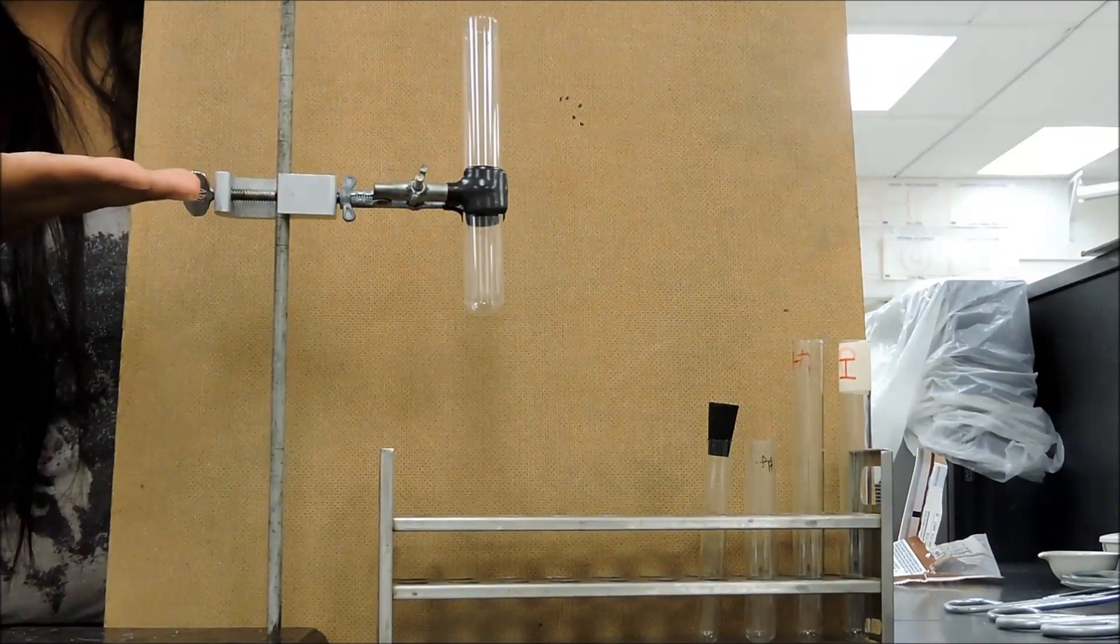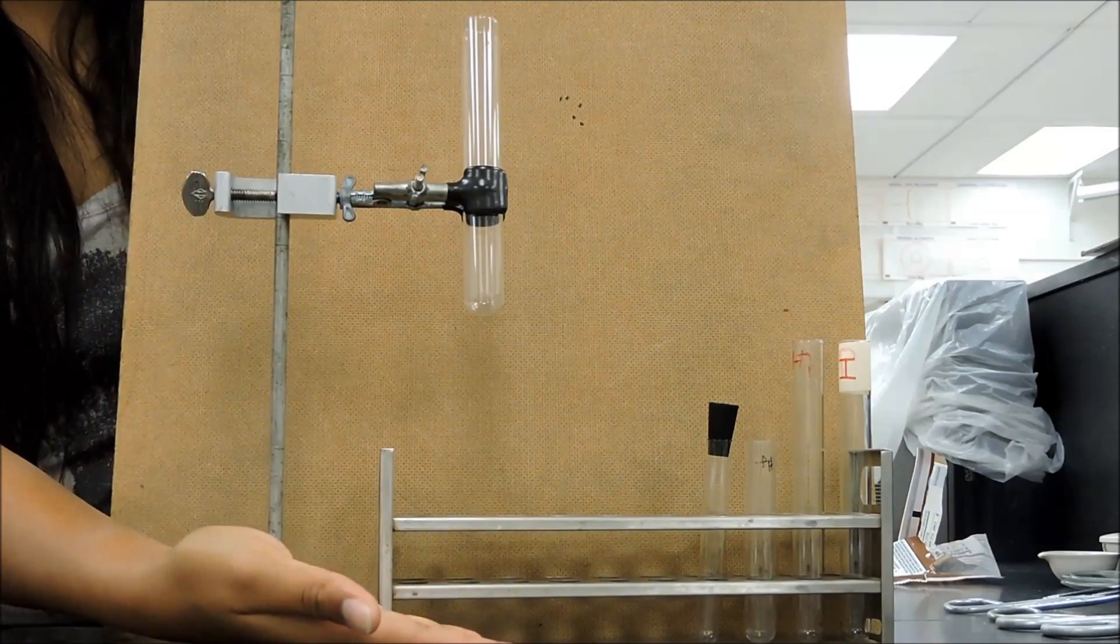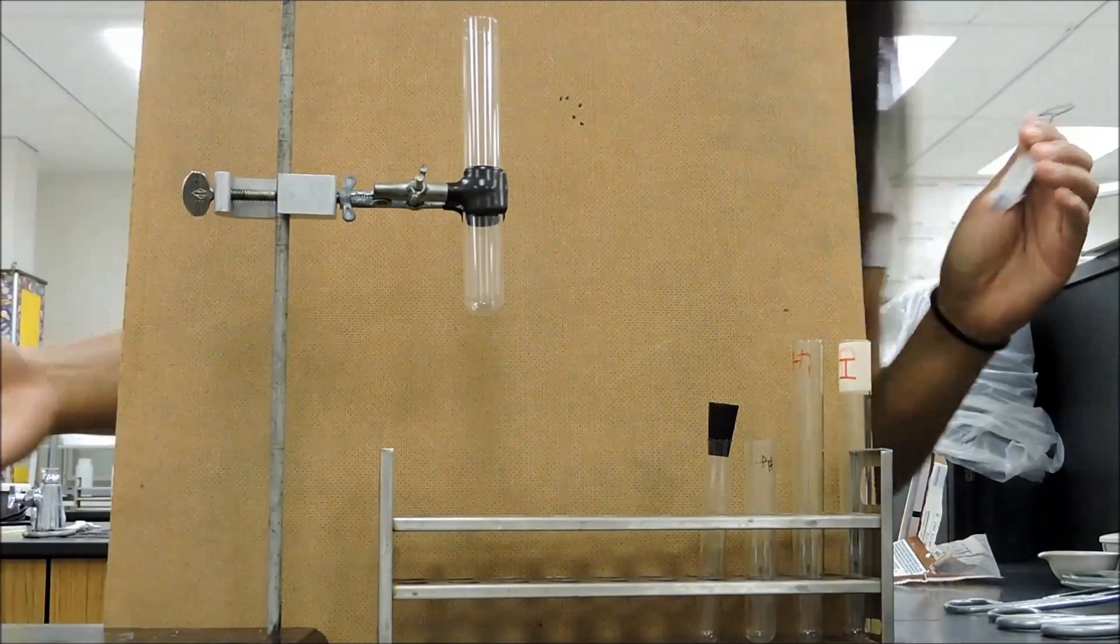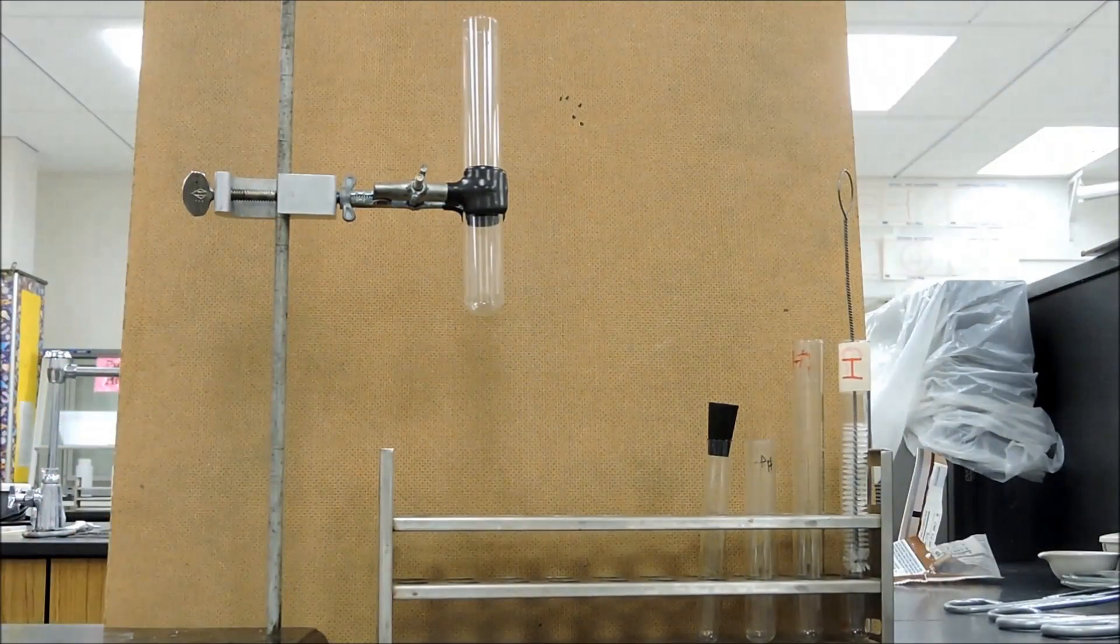The utility clamp is meant to elevate test tubes. Test tube racks hold multiple test tubes at a time. Test tubes hold solutions. The test tube brush is meant to clean the test tube. The cap closes the test tube.